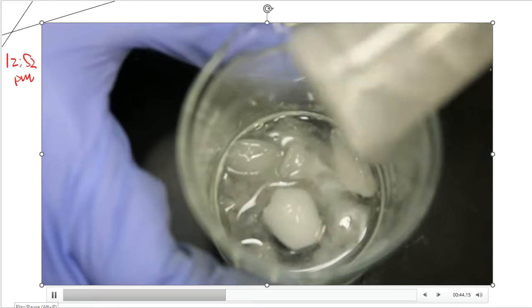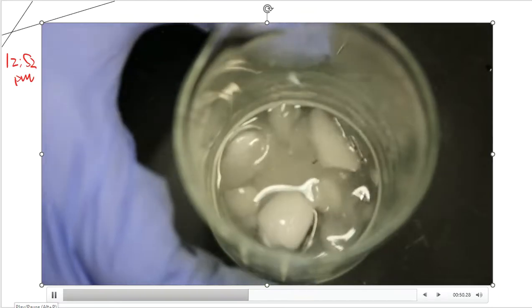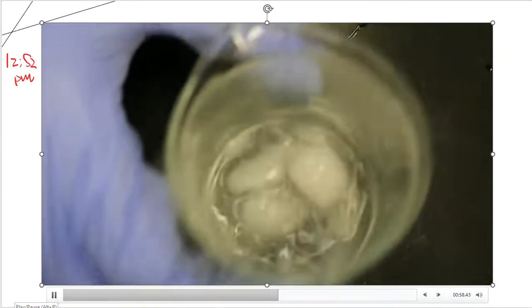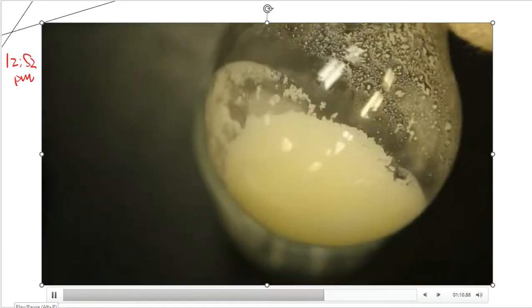Notice that the solution is starting to precipitate out this whitish-looking crystal, and it also looks like I'm getting some water droplets that really is not water at all. It's just not soluble in the water, it's settling out on the bottom. So now I get this crud that's left over into the flask. Look at that. That's all solid. Every bit of that is solid right there.